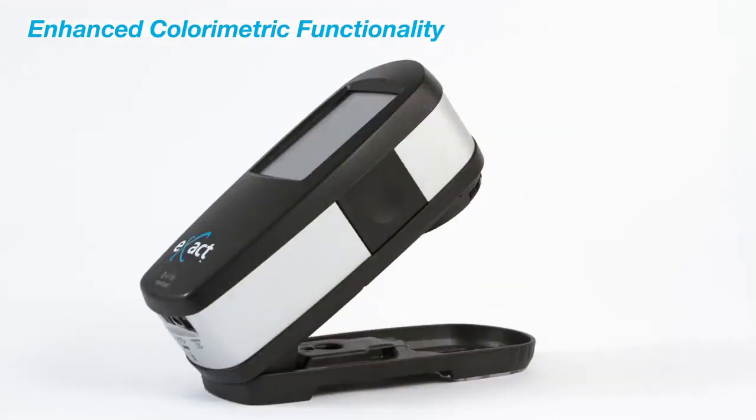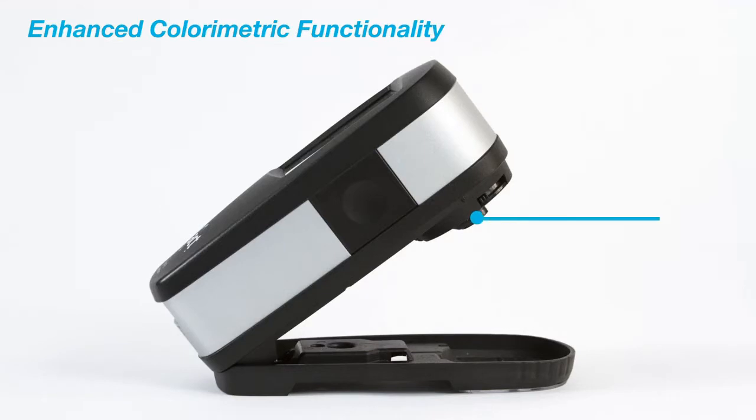A state-of-the-art calibrated white tile is integrated to guard against dust and fingerprints and provides you with the most accurate calibration, ensuring you will have the most precise measurements each and every time.